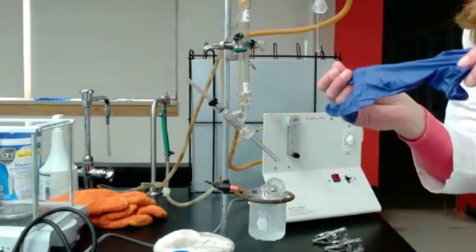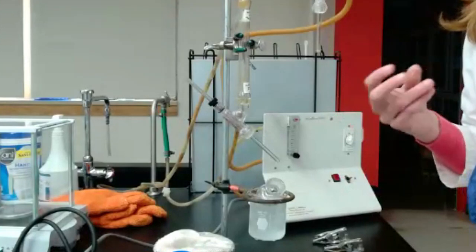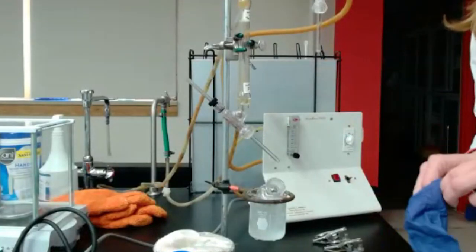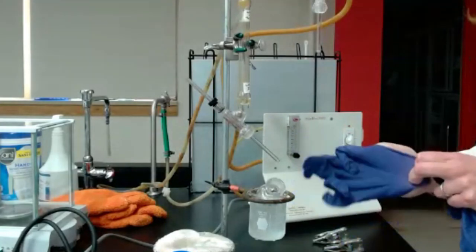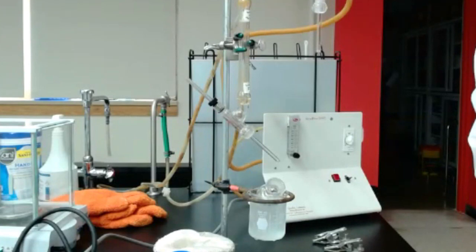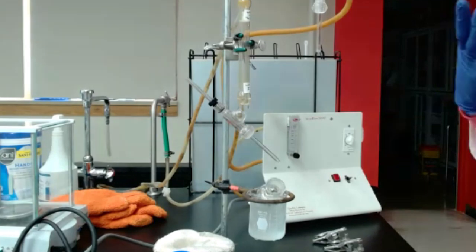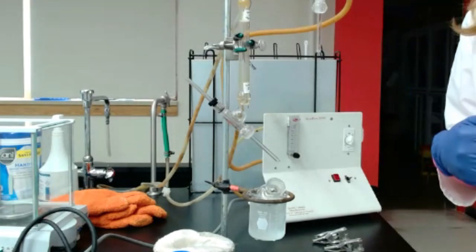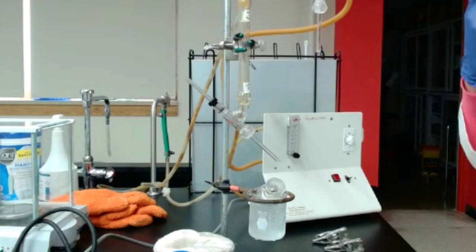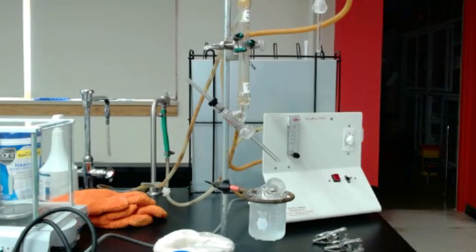And so the gloves, that's the most important part, because you don't want to have phosphoric acid or sodium hydroxide in your hands, or hydrogen peroxide in your hands. So make sure you have those gloves. Also, you will need to have goggles. Goggles are really to make sure you don't have anything coming to your eyes. Because if you have, once again, sodium hydroxide or phosphoric acid in your eyes, it's going to be really, really irritating and pretty bad. So make sure you wear protective equipment.